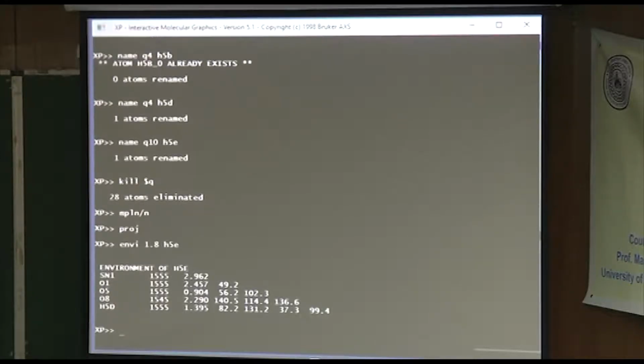these four numbers here that precede that, 1545, are telling you by this ORTEP code that it's in a different general position. It's not just connected as I have it now. So I need to shift it to make it connect in the picture, which is a little tricky. I want to move the water, not the other molecule, but you could do it either way. So what should I do here? Oh, the way these codes work, I should tell you.